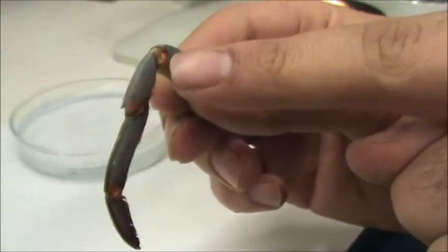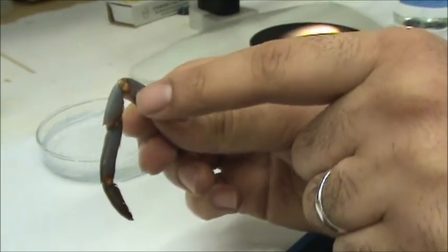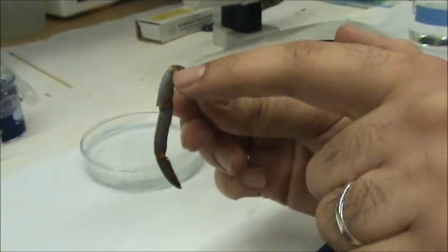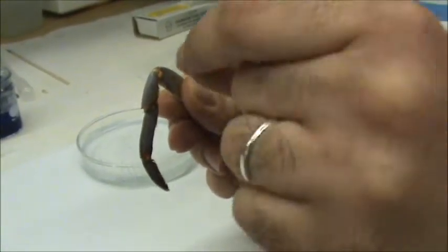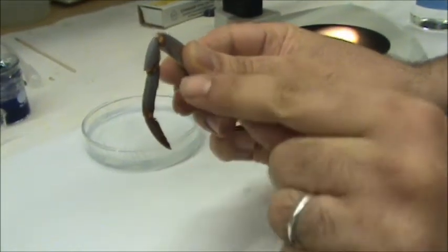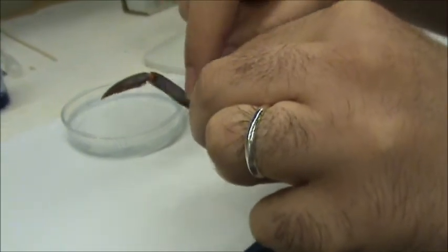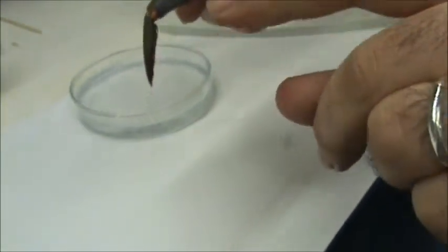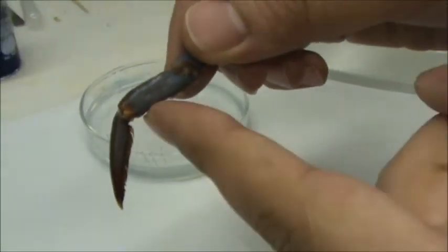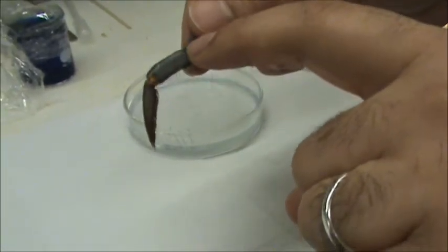The motor neuron that we will stimulate when you do electrophysiological recording is located underneath the bender muscle. Therefore, we have to make a window here and remove the cuticle, then remove the bender muscle. Then after that, we will dissect the propodite. If you look at this region, this is the dorsal region, and this is the ventral region, and the opener muscle is located here.